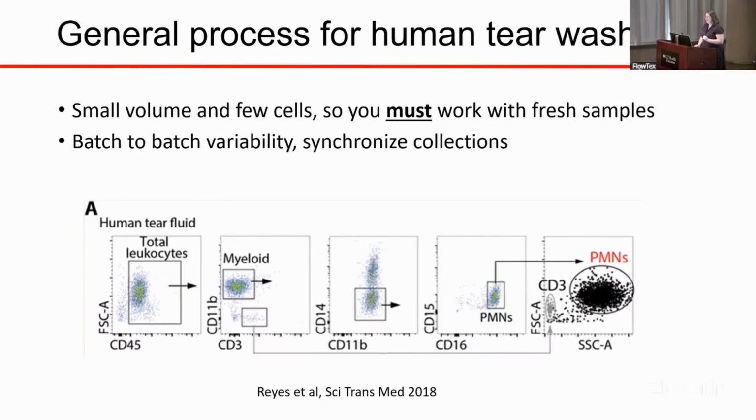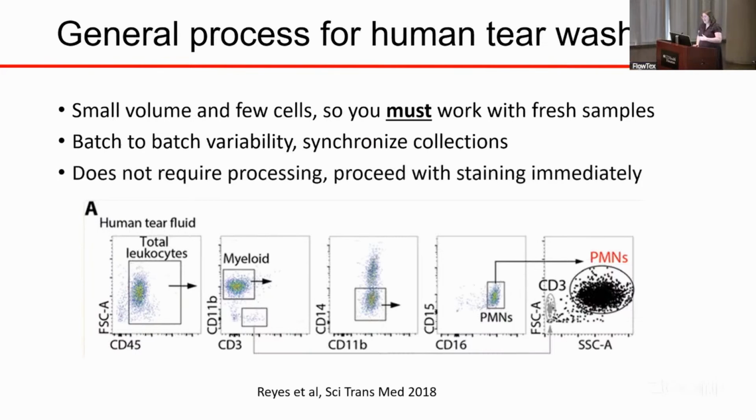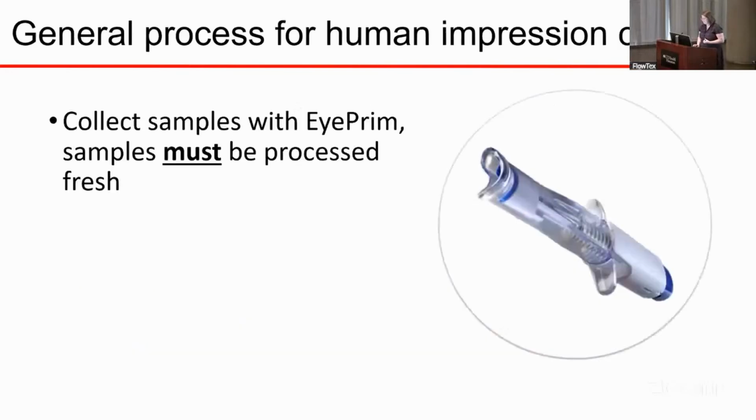But this means it's very difficult for the doctor because you have to synchronize when patients come in and when the doctor can collect the samples. But please try as hard as you can to do these things because it really does help minimize your batch-to-batch variation. And as I said, it does not require processing, so you can just proceed with staining immediately.